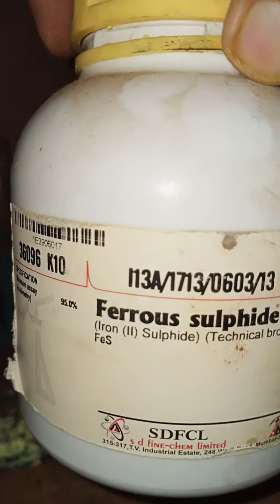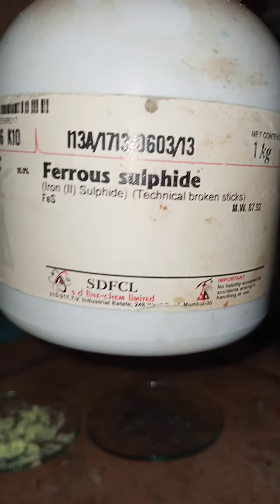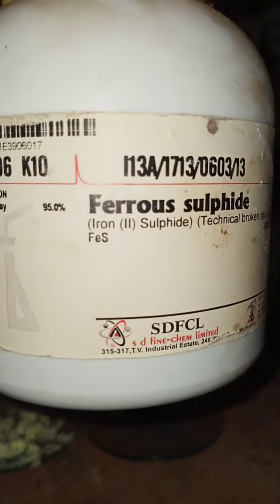You can see here, when we heat these substances, we get ferrous sulfide. That is the reaction between the iron and sulfur. So this is your ferrous sulfide which is being produced due to this reaction. And then we have the mixture of sulfur powder and iron filings. Now I am going to perform a few tests.